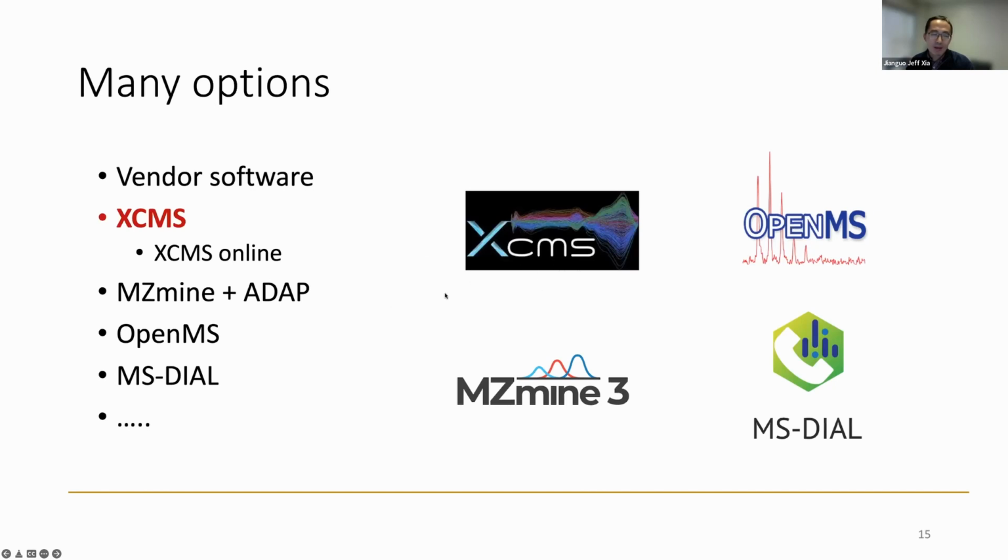There are multiple excellent, powerful tools that we use a lot: XCMS, OpenMS, MS-DIAL, and MZmine 3. We don't only use our own tools, we use all of them at certain times. We also borrow a lot from their concepts by benchmarking against the different tools, seeing what the differences are and learning from that.